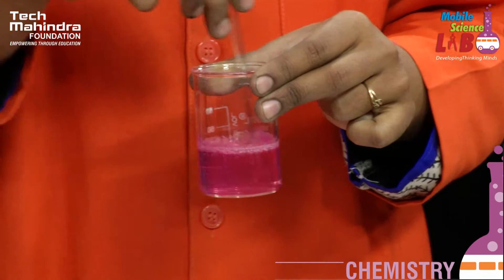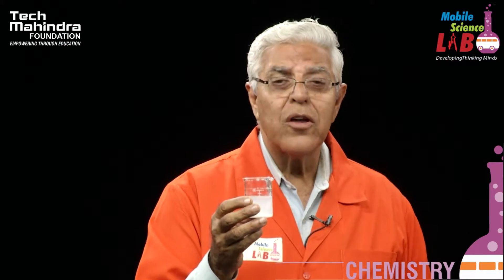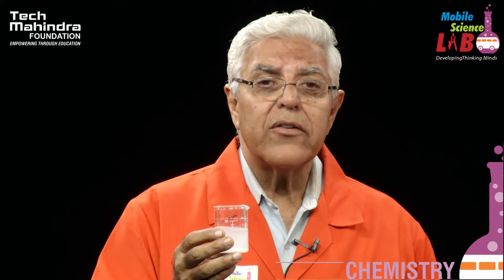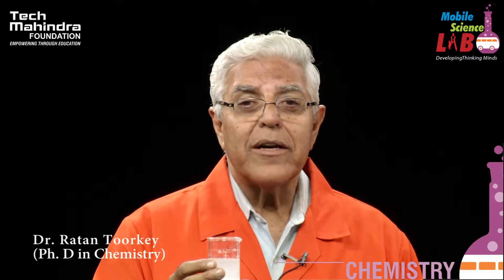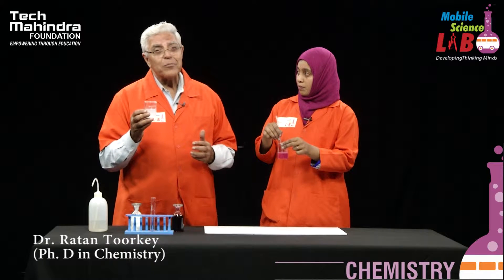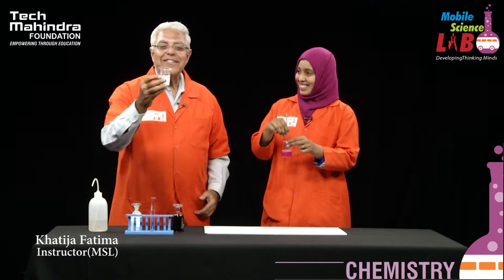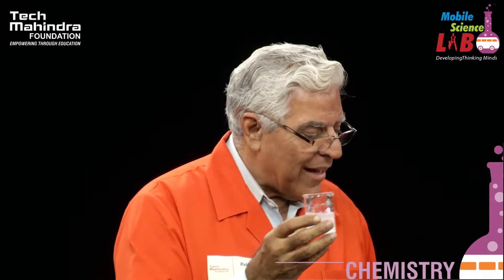And in this beaker, I have got a saturated solution of borax. Borax is the common name for a chemical which has got a big name: disodium tetraborodecahydrate. Borax is enough, I think. So this is a saturated solution, and I will add a few drops of this and Khatija will shake.